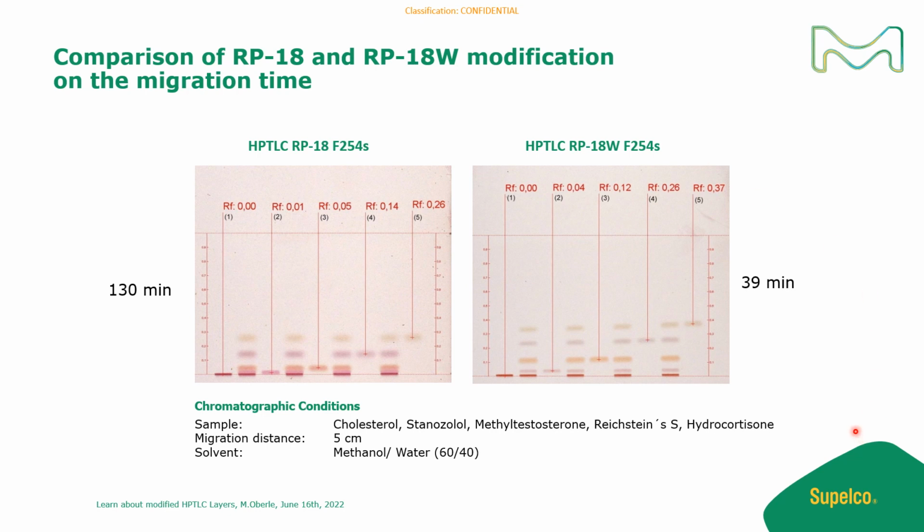This example shows the same application on the normal RP18 layer compared to the RP18W layer. And you can use here up to 100% water in your solvent mixture and have in this example much lower migration times for the separation.